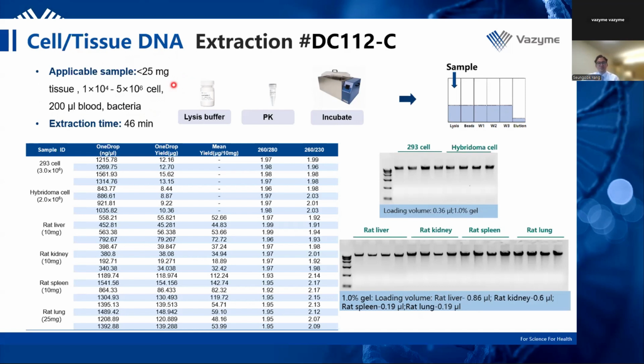So the full extraction process takes only 46 minutes. And this one involves three main steps, which is lysis with buffer, protein digestion using proteinase K, and incubation, which is followed by binding and washing steps using magnetic beads.